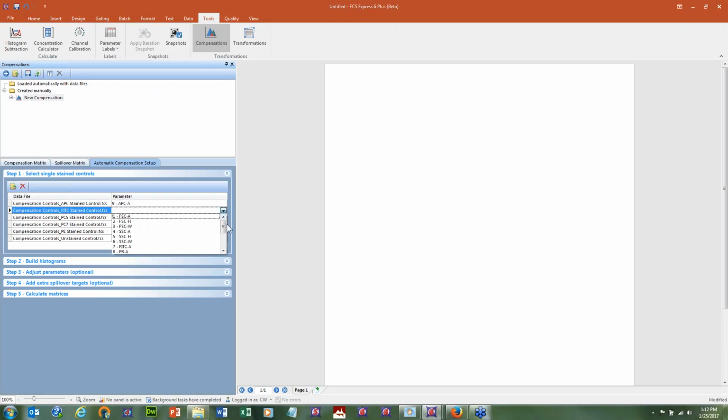And as I'm doing this, just to drive the point home, this really is the best way to do your data analysis, because by doing so, FCS Express in the final result is going to align the median of your negative population with the median of the positive population in the spillover channel. That's much better done mathematically than trying to do it by eye, which usually results in a subjective matrix that can be measurably different from the automatically created matrix.